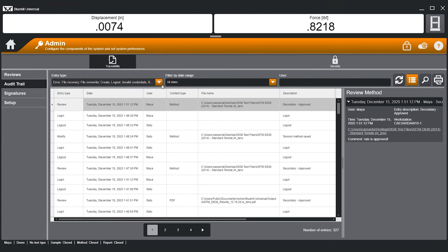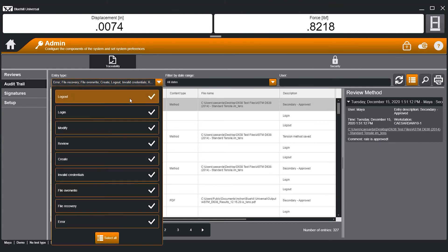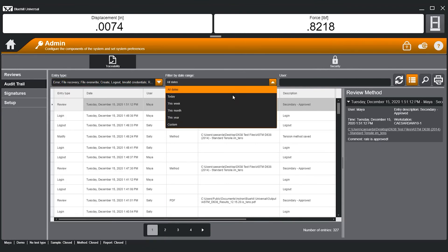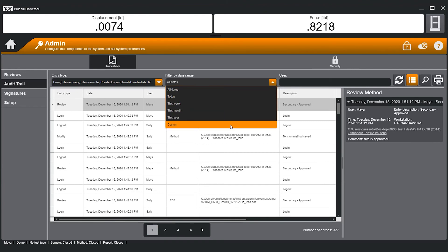System-level activities range from creating a new test sample to a failed login attempt. Search fields and filters enable users to sort through thousands of items in just a few seconds.